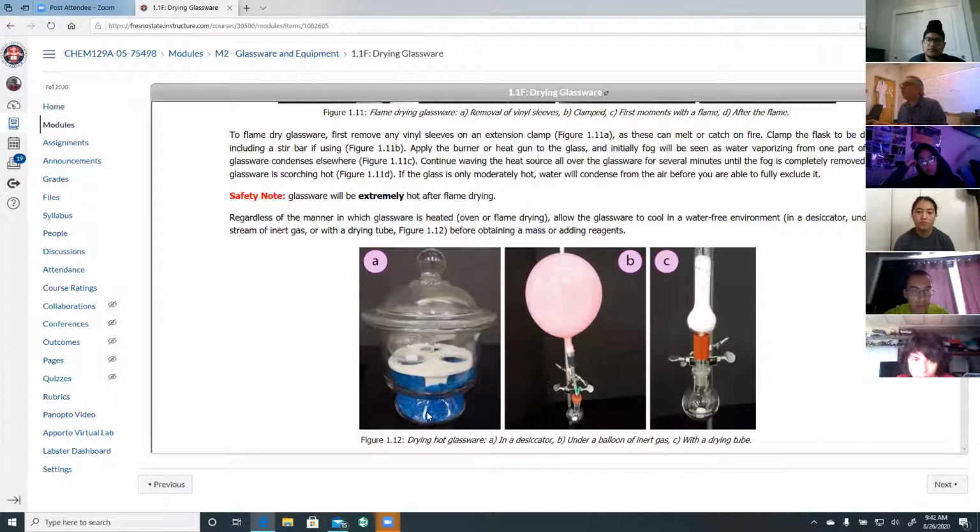This blue stuff at the bottom is something that soaks water. Desiccant means something that reacts with water and makes the environment dry. You have seen noodles or cookies, maybe fancier cookies. It comes with a little pack that says silica gel or something. That stuff is a desiccant. It keeps that environment around the noodles or, I don't know, cookies or candies, it keeps that area dry, okay?